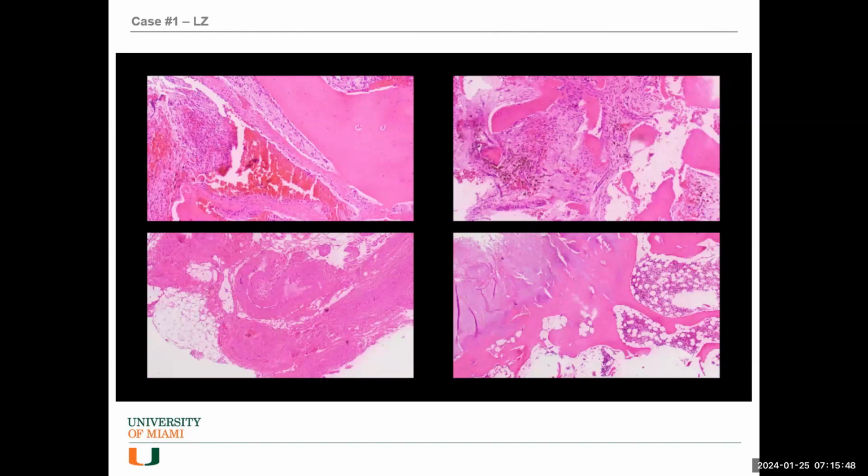Hemorrhage. Again, hemosiderin deposits on the right side. So bone marrow, and on the left lower, interestingly, some very thick walled blood vessels. And I wasn't sure if these thick walled blood vessels represented some kind of vascular pathology, or was it part of the tissue that was taken out. That I wasn't sure, but Dr. Elizabeth Montgomery looked at this case and she signed it out as, do we have another slide?